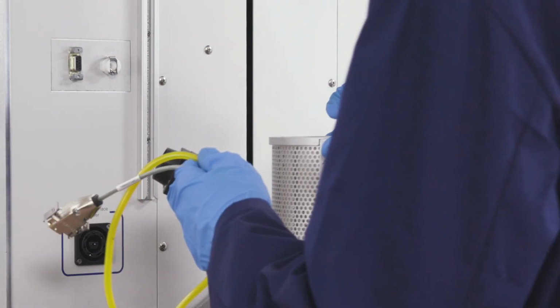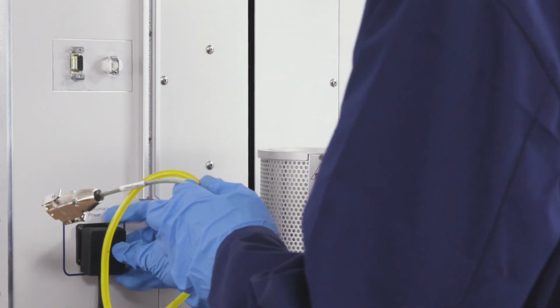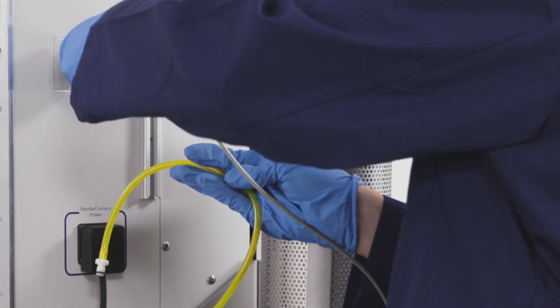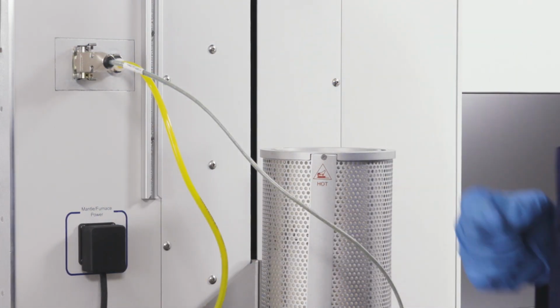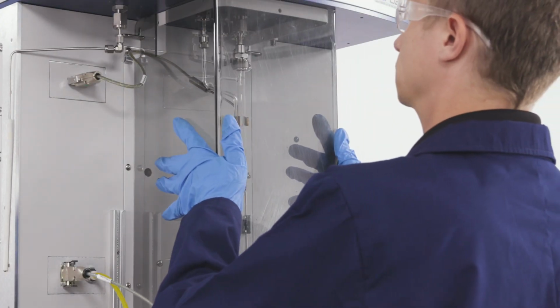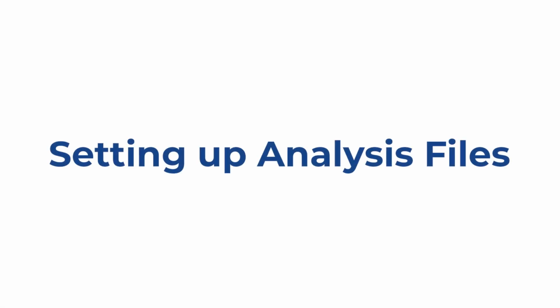Take the chemisorption furnace and plug it into the power outlet on the 3Flex. Attach the air line to the front of the unit as well. Lastly, place the splash shield on the unit. The sample is now ready for analysis. Let's look at setting up the analysis file in the software.